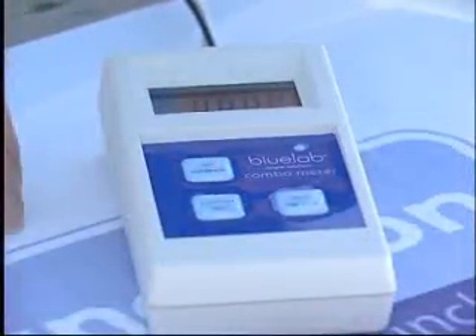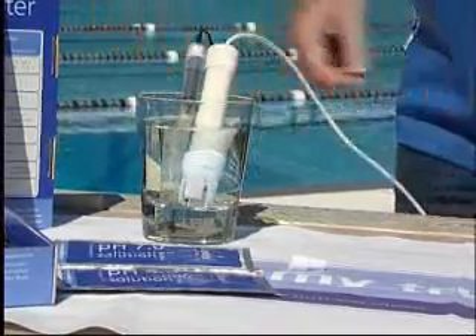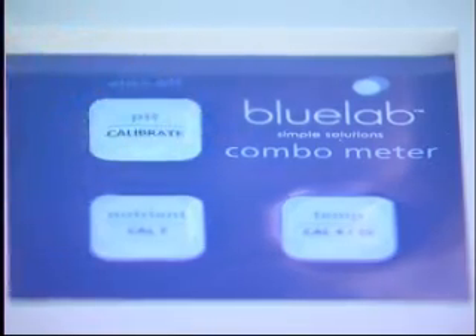To operate, simply turn on the unit by pushing any button. To take a reading, place either or both probes in the solution and the selected measurement will appear on-screen. You will then notice the reading will change quickly, then slowly start to settle on an accurate measurement.